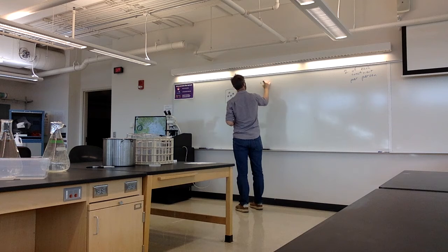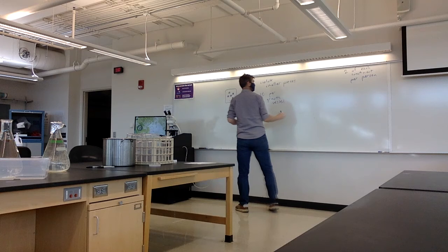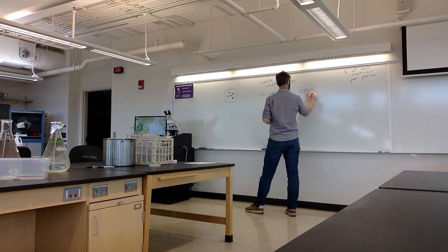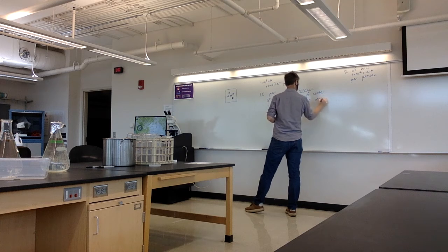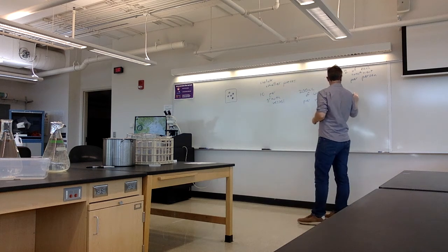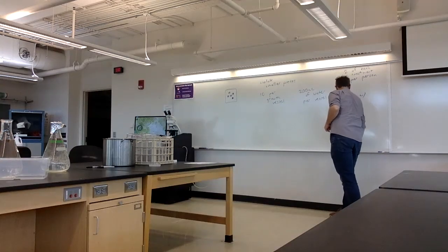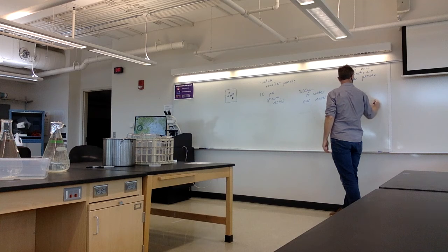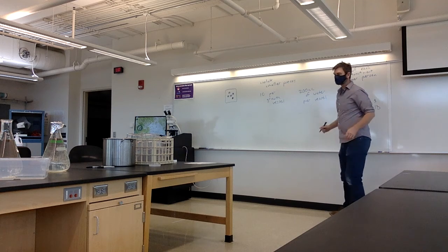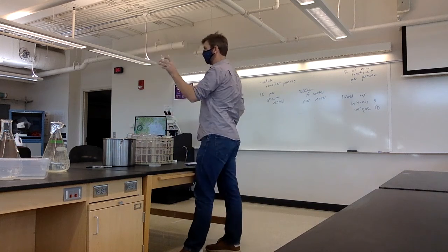Okay, so water per vessel. So I didn't clean off the labels from the last experiment I did.